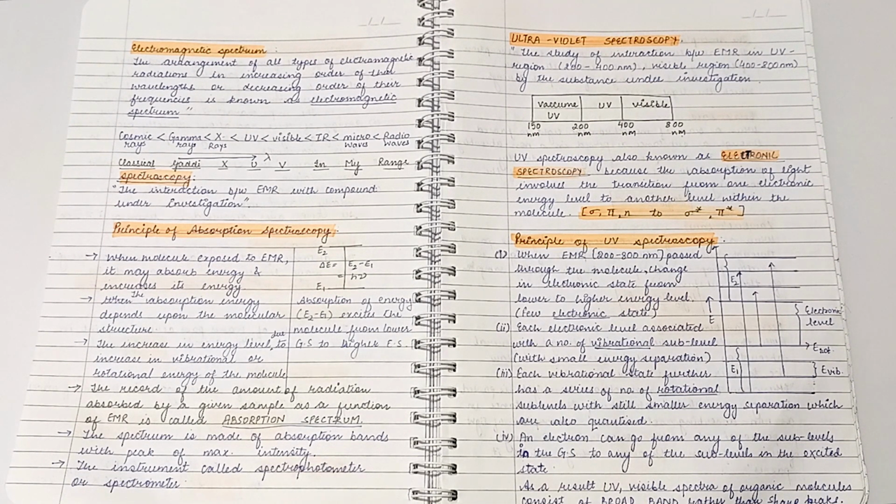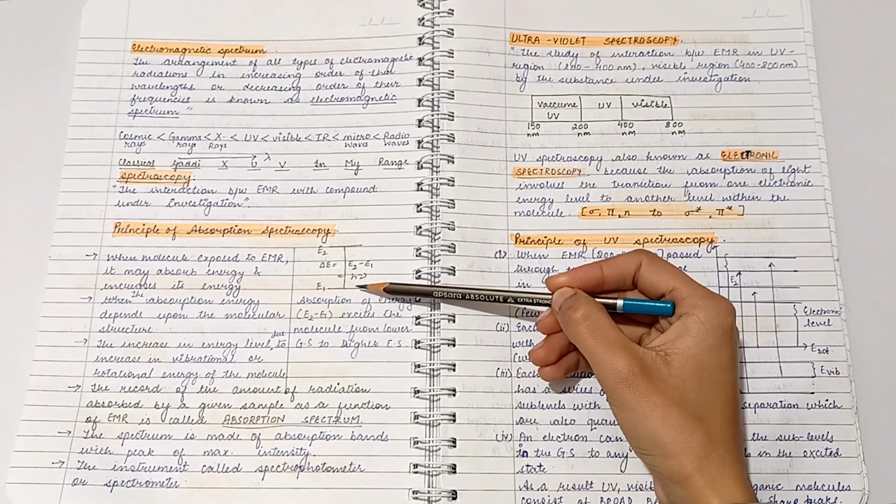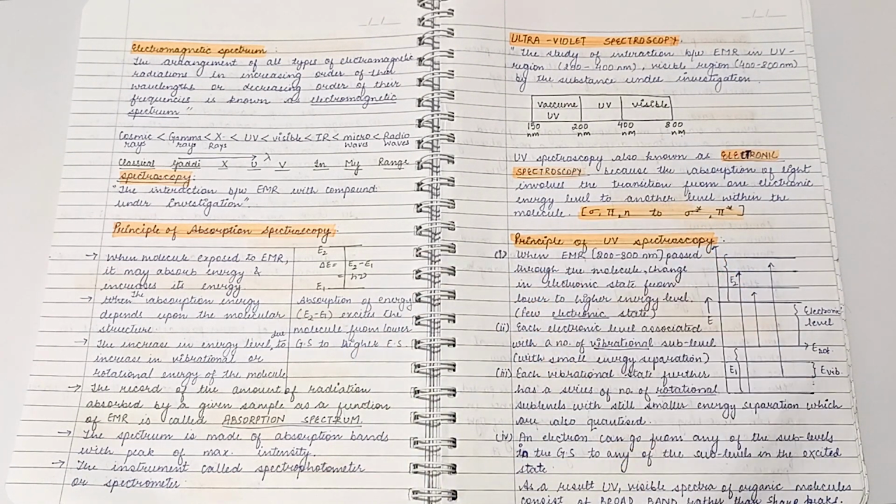The record of the amount of radiation absorbed by a given sample as a function of electromagnetic radiation is called absorption spectrum. The spectrum is made of absorption bands with peaks of maximum intensity, and the instrument which is used for this is called a spectrophotometer or spectrometer. Absorption of energy leads to excitation of a molecule from a lower energy level to a higher energy level.